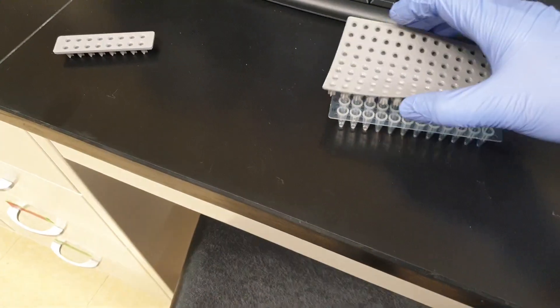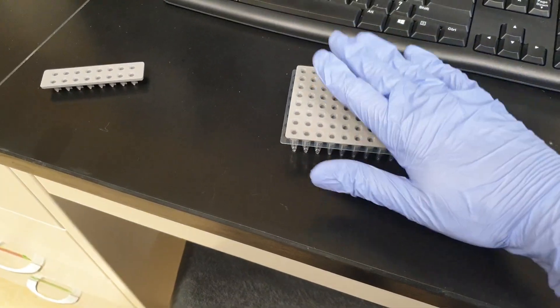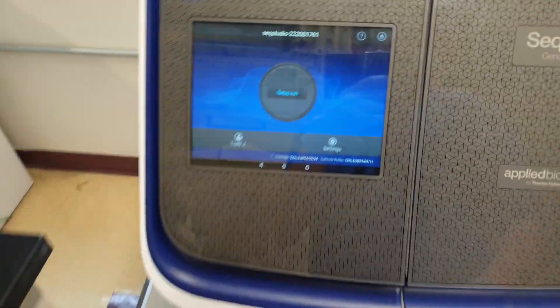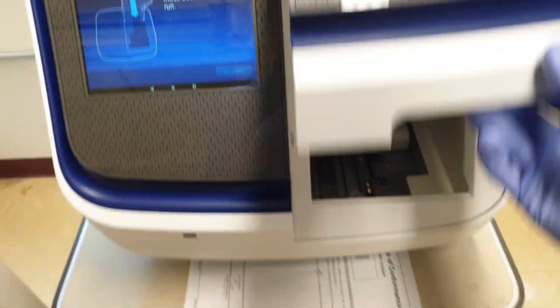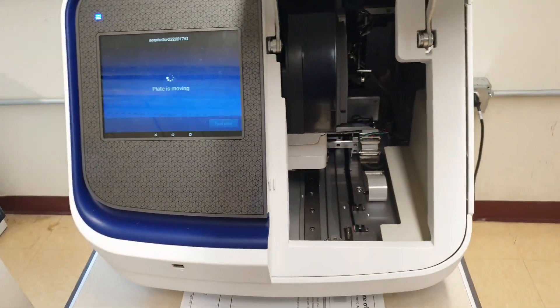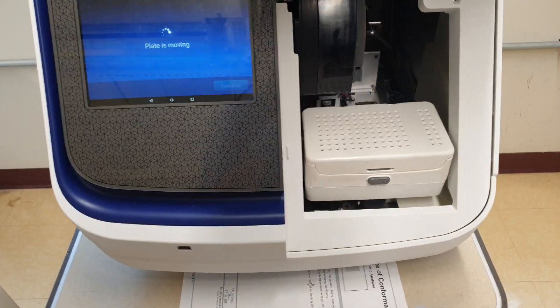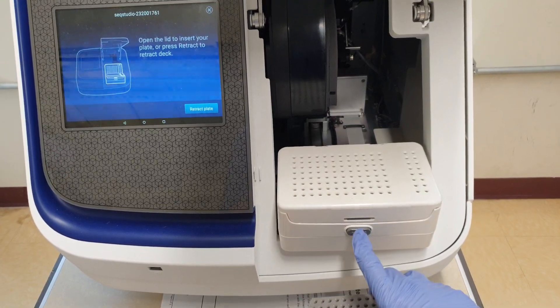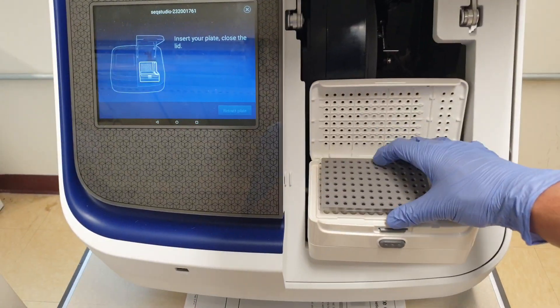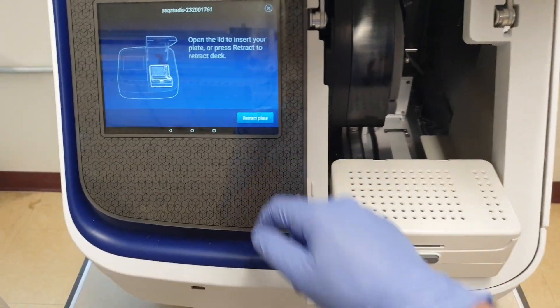We're going to take one of these tops that'll cover the plate. Click on this, eject plate. Place it. Retract plate.